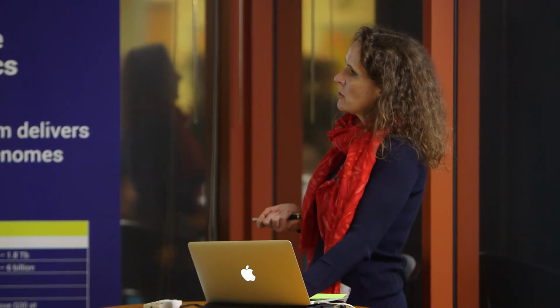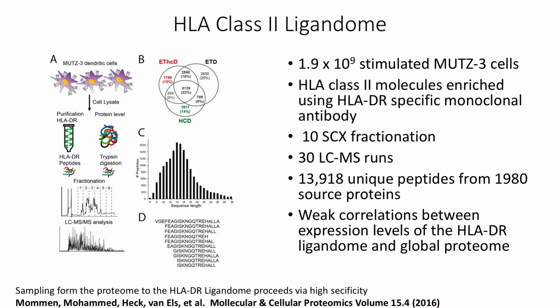So, and then this is a recent paper. Again, I think this is by the Heck group in 2016. So they started with stimulated dendritic cell lines. And again, this is close to the amount that Don Hunt used about 25 years ago.